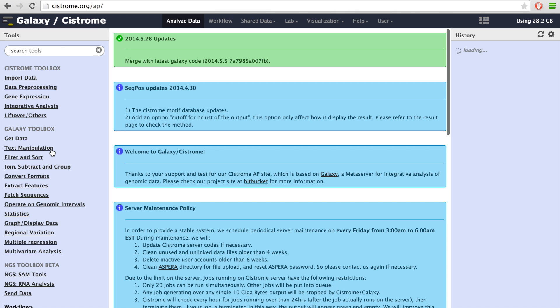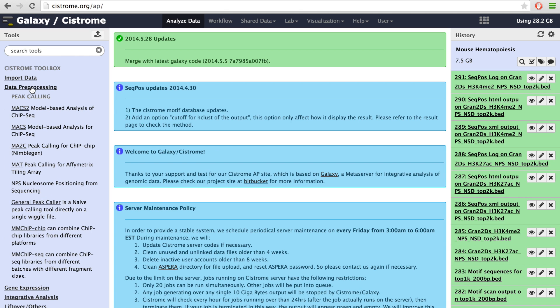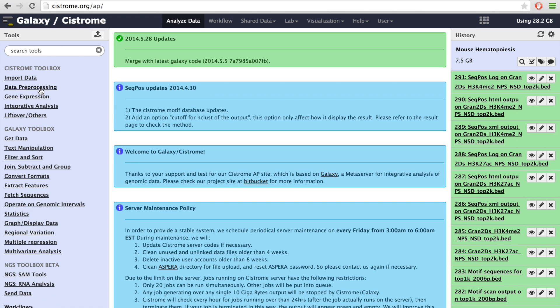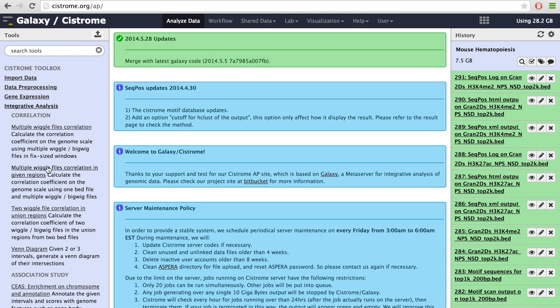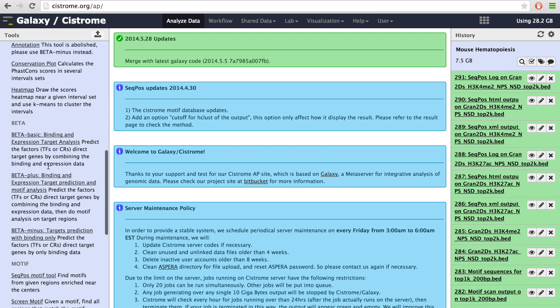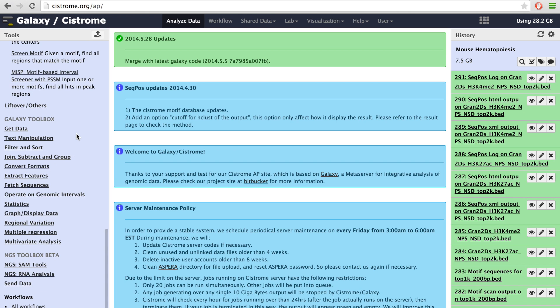The Cistrome analysis website is built based on the Galaxy framework, and the web interface has three panels. The left panel shows all the available tools, including data uploads, data preprocessing including MACS for ChIP-seq peak calling, gene expression analysis, and various tools for the integrative analysis. Some other publicly available tools for next-generation sequencing analysis are also incorporated here for users' convenience.